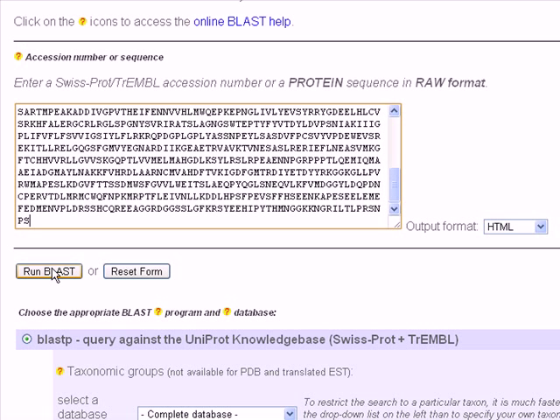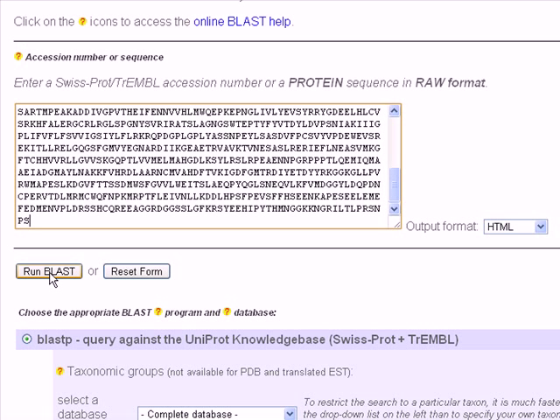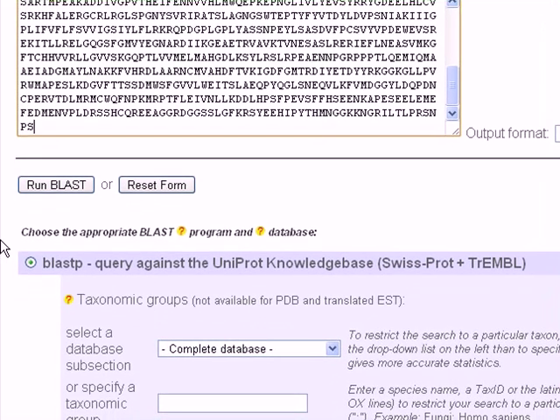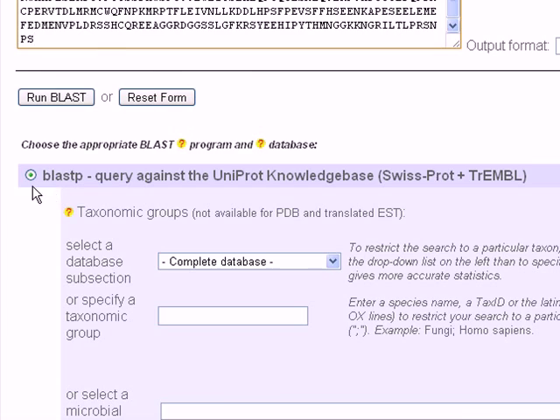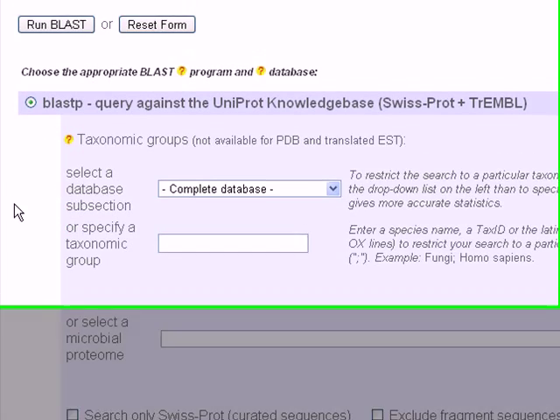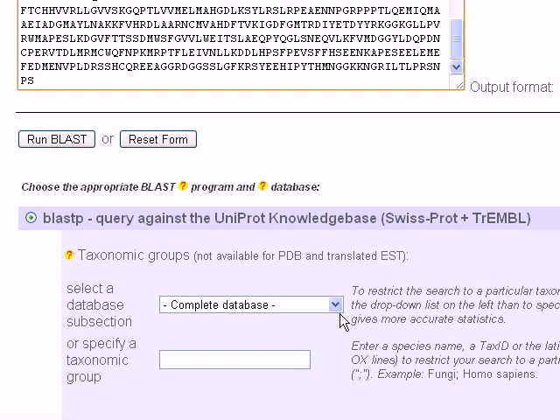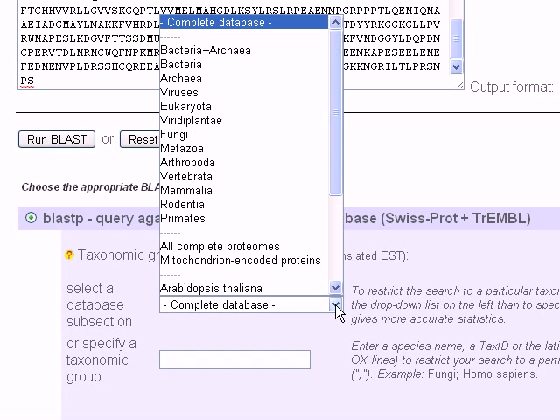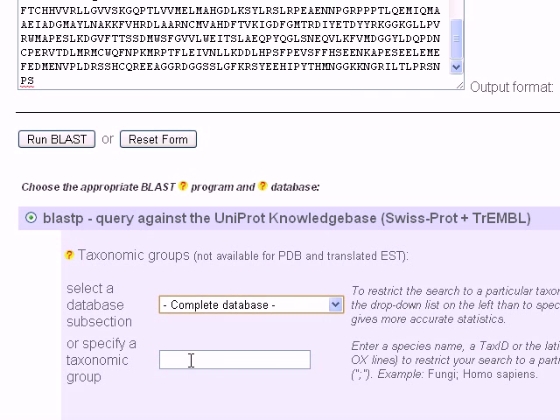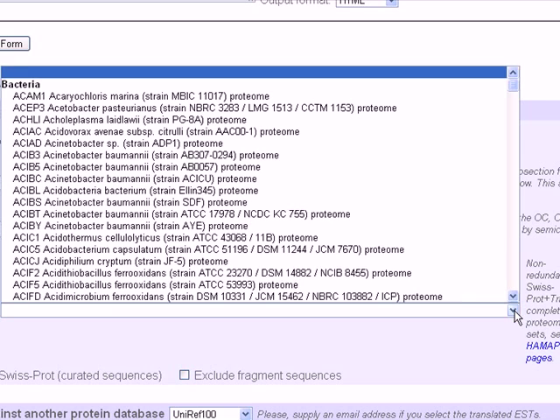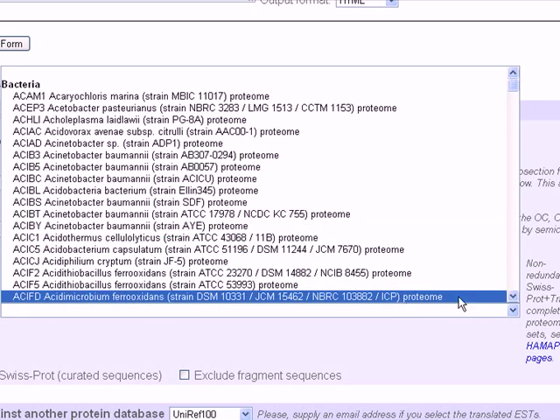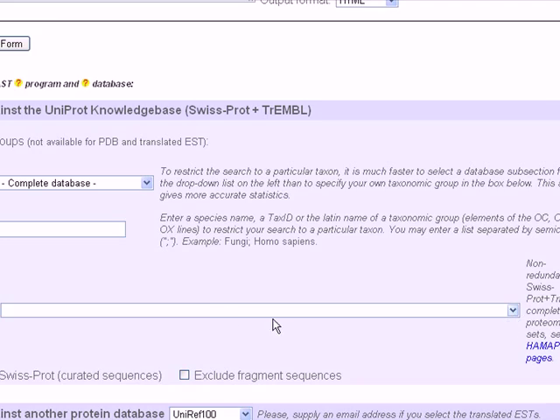We can run BLAST from here, or if we want to set different settings, for example, we can change the database here. If we know that our sequence is a bacterial or viral sequence, for example, a protein sequence, we can specify a taxonomy group. Here, if we know the name of the bacteria, we can set the name from here.